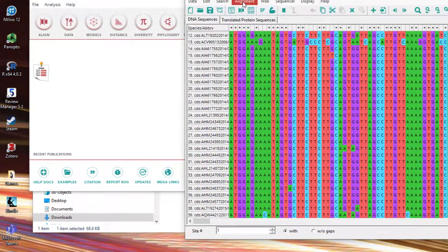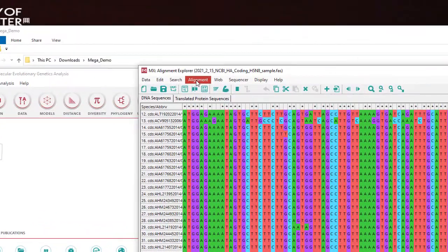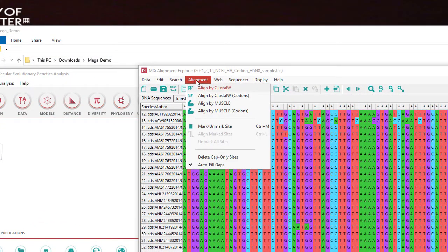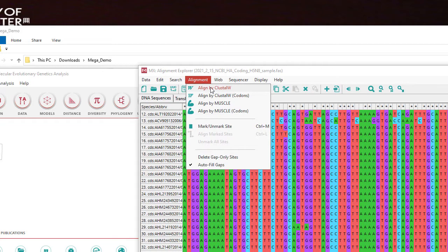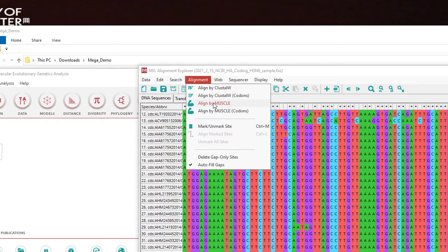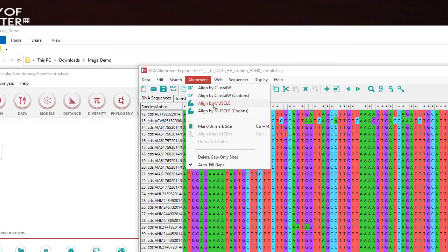So in MEGA you need to go to alignment and you can choose two different built-in programs. You can have ClustalW or you can have Muscle. Now ClustalW has been updated and replaced first by ClustalX and now by ClustalOmega. It is not a very good system. It is slow and doesn't give great results. Muscle gives better results but it's ideally optimized for protein. There are other programs you could have used and aligned outside MEGA and then just read the alignment in but we'll use Align by Muscle.